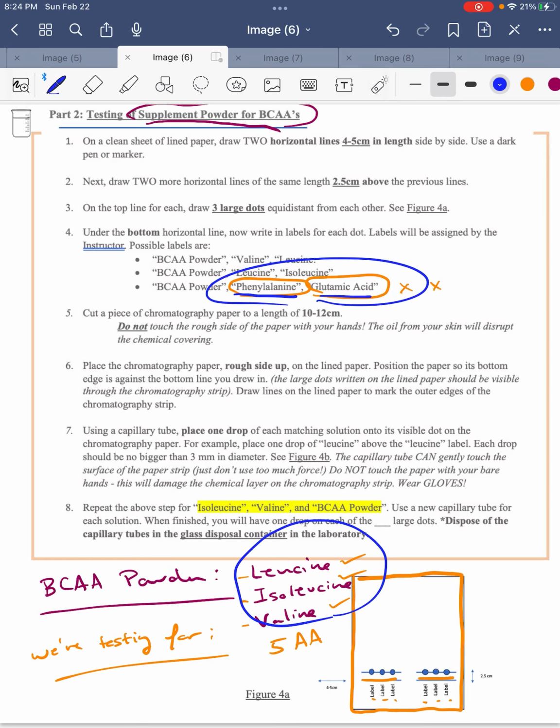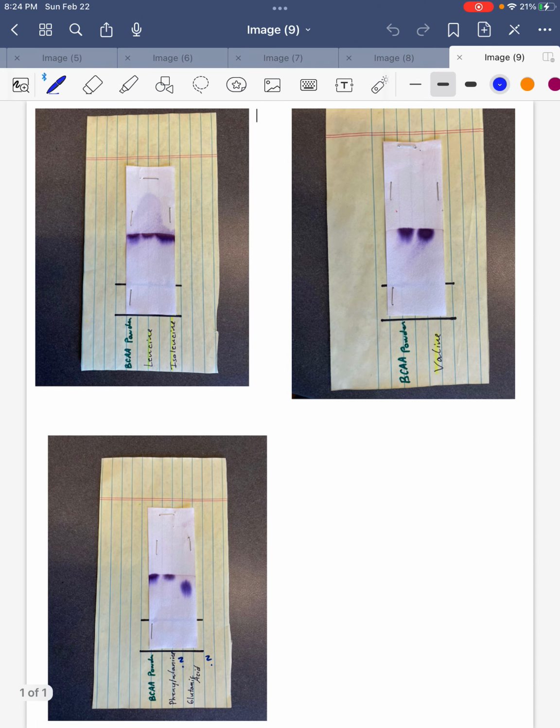All right, drum roll, please. Are you ready for your results? I can see you're excited. Here they are. Oh, excuse me. I think I have to sneeze again. Hold on. My apologies.